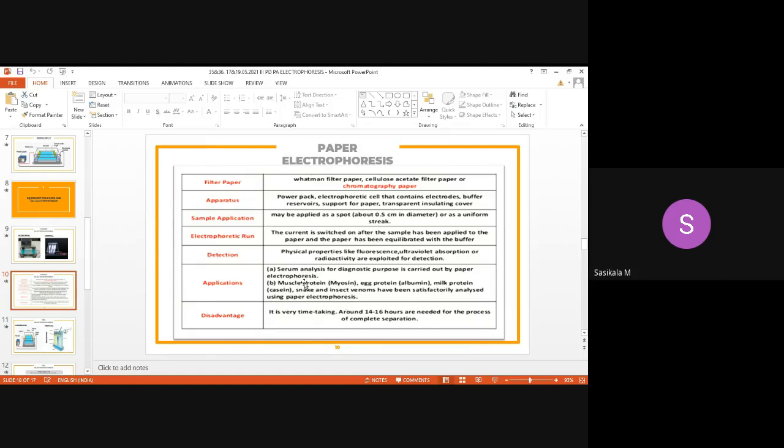Proteins are zwitterionic molecules, amphiprotic in nature, so they can have both positive and negative charge. When you increase the pH, the molecule will act as an anion. If you decrease the pH, the molecule will act as a cation. So according to the isoelectric point, the pI value of the individual protein, we can decide whether acidic pH or basic pH is required for the separation.